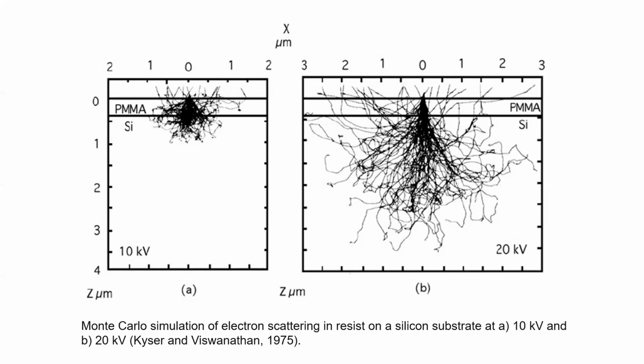Now, electron beam broadening, which is also called spreading in EM specimen, is a phenomenon where the electrons from the incident beam distribute wider than the beam size due to scattering by the atoms in the irradiated materials. So electron beam broadening affects especially the spatial resolution of the techniques using small electron beams.